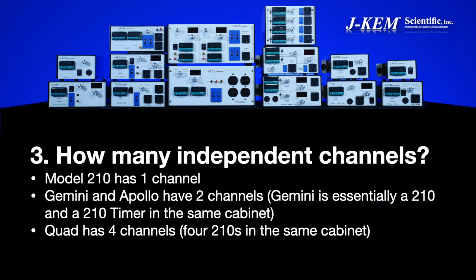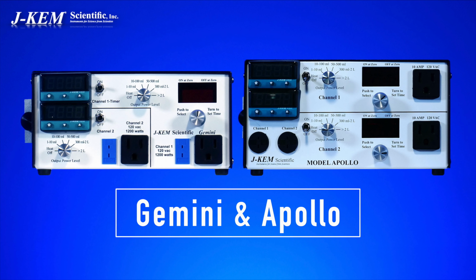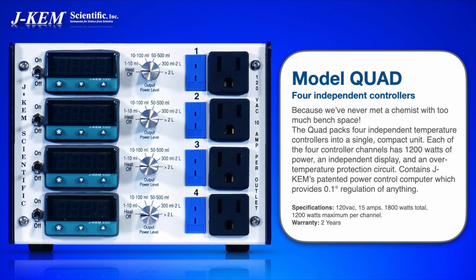And so we offer several models that are 2-channel, the Apollo and the Gemini, for example. For someone who really has a need for multi-channel control, we offer a quad controller. Basically, it's just 4 210s built into a single cabinet. It's just a matter of practicality.